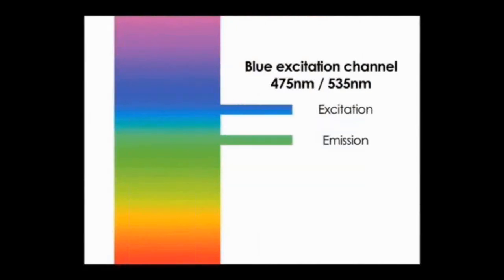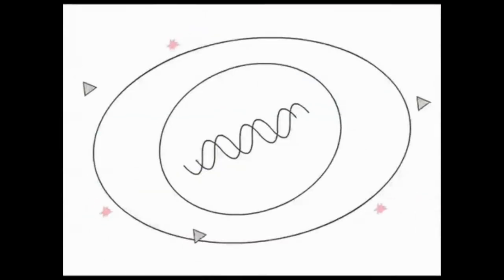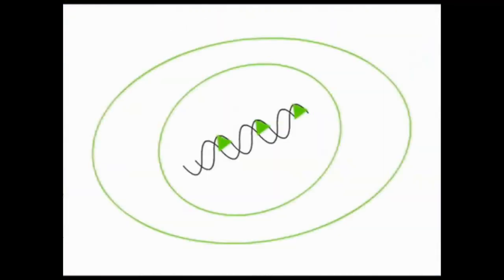Channel 1 of the Cellometer is configured with an optical module with blue excitation and green emission. For a live cell, AO enters the cell membrane and binds to its DNA. Under blue excitation, strong green fluorescence is emitted and detected.